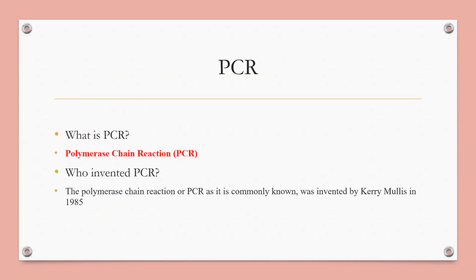The polymerase chain reaction is a laboratory technique for generating large quantities of specified DNA. PCR is a cell-free amplification technique for synthesizing multiple identical copies, billions of copies, of DNA of interest, of DNA fragments.